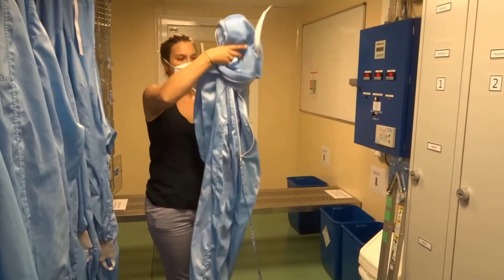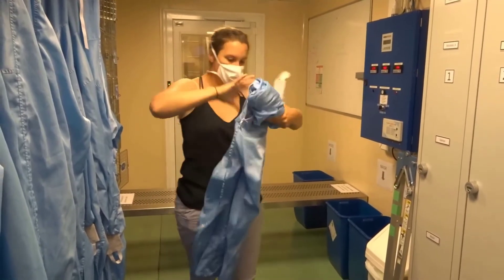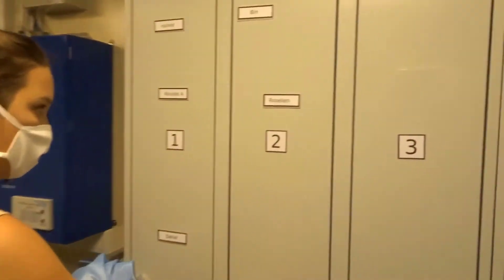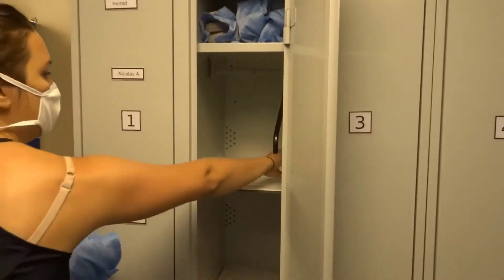If you plan to come again during the week, fold the garment in half and roll it in order to place it into a dedicated plastic bag, and then into your locker — only for you to re-use.